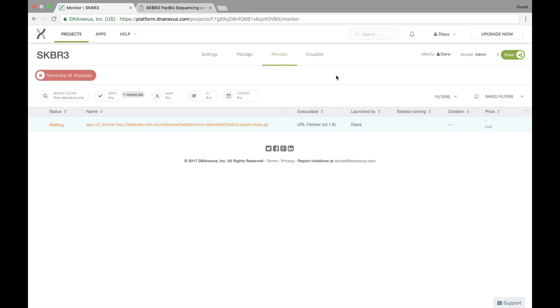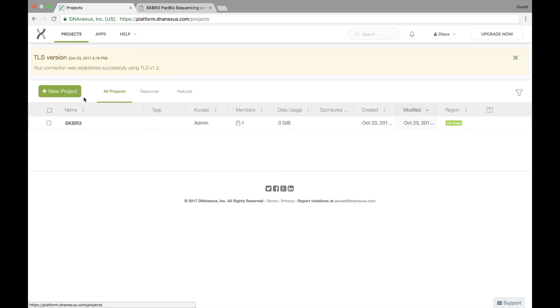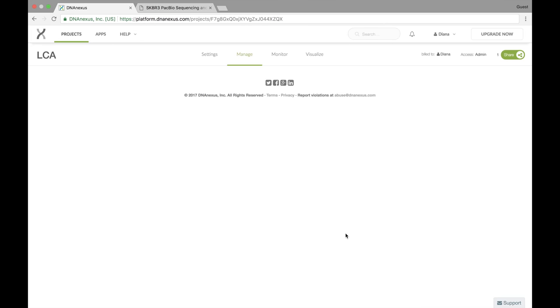In addition to SKBR3, I also have another project that I'm working on. So I'm going to go back to projects up here and create a new project. And this is for a study on a congenital form of blindness called LCA. So I'm just going to create that project.